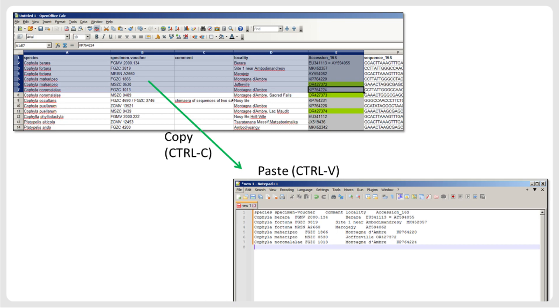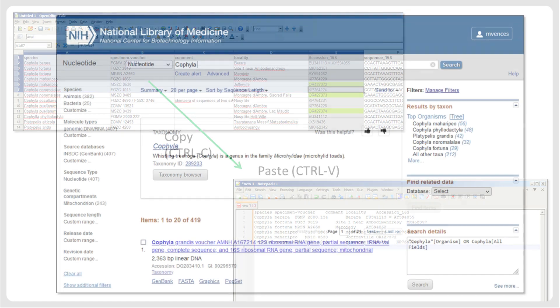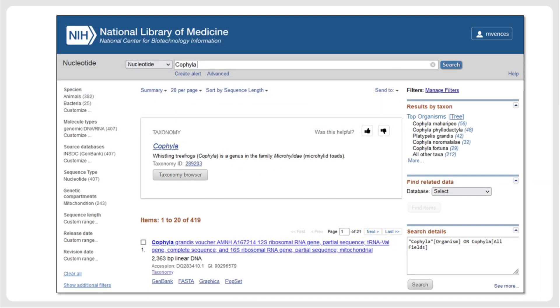Similarly, you can copy a tab-delimited text from a text editor and paste it into a spreadsheet editor, and it will automatically be arranged in rows and columns. Now, let's look at some examples of how DNA sequences and associated metadata can be entered into spreadsheets.